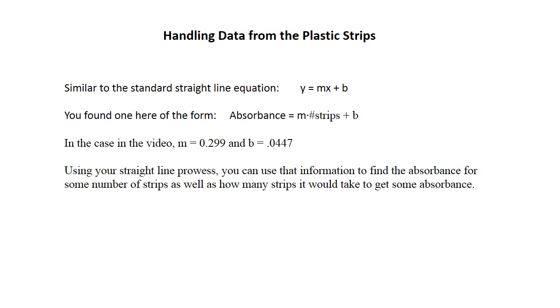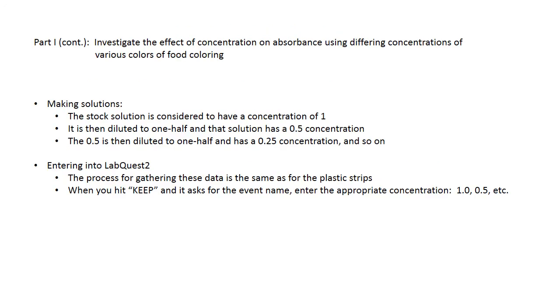We could do that, and that actually would give us a value in terms of millimeters or centimeters or whatever we wanted to do. So using that is pretty straightforward. Now, in the next part of this part one, we're going to take a look at the effect of concentration on absorbance.